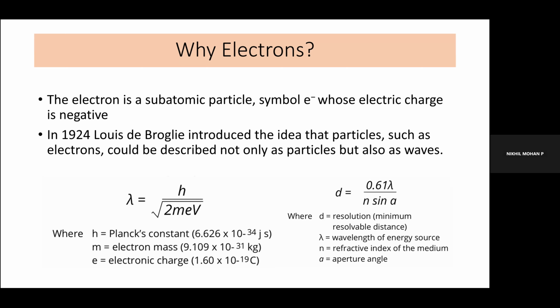Commonly used electron microscopes are transmission electron microscopes and scanning electron microscopes. Then there are some other spectroscopic microscopic methods like EELS, EDS. And then we use this particle nature of the electron for crystallite analysis, like SAED patterns, selected area electron diffraction, and lattice imaging. So that's why we are using electrons in an electron microscope. And the wavelength, we just move from the point, like how we are generating this electron beam.